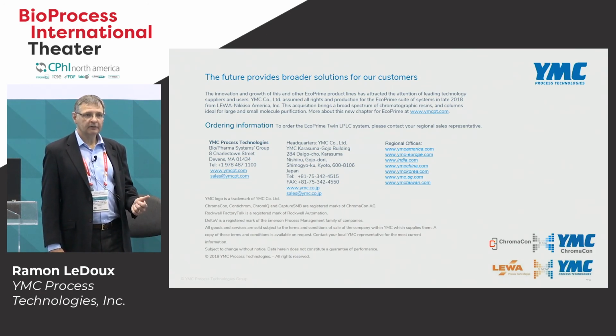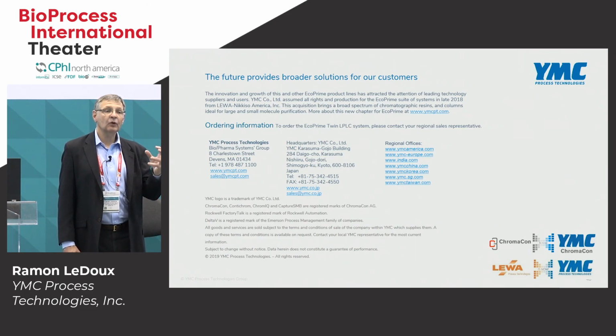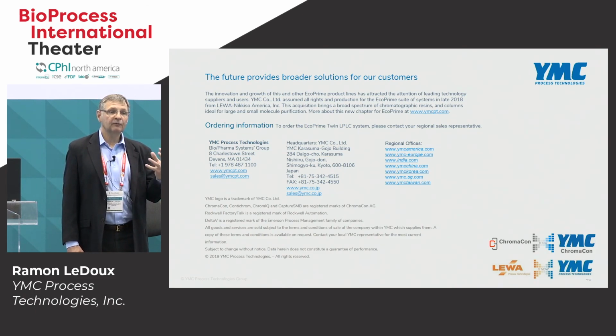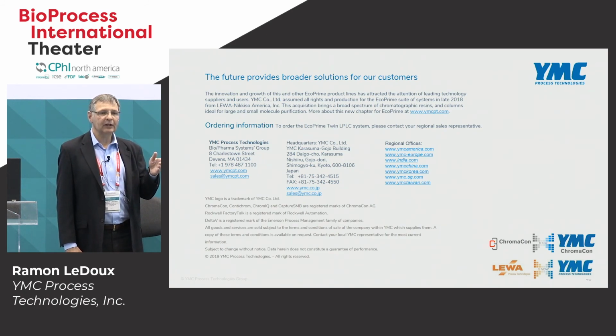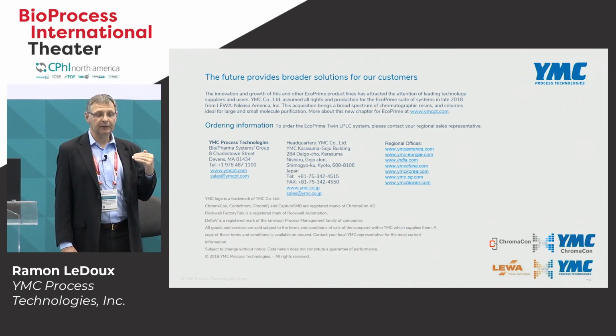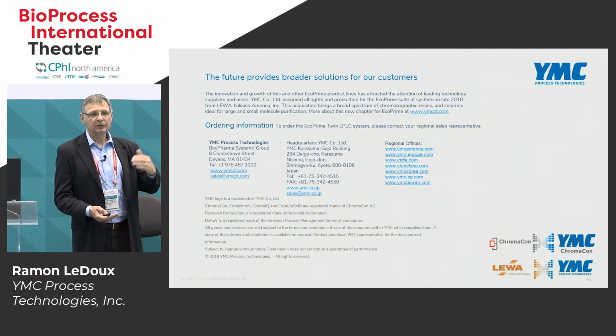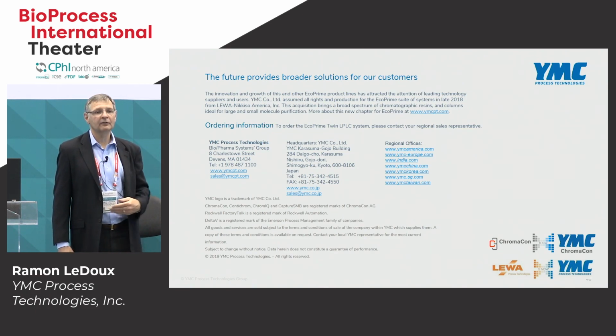Yeah, protein A is still the gold standard. I think what people are more interested in looking at now, not so much changing the chemistry because it's such a proven technology, but changing the orientation of the chemistry. So now you see immobilized, functionalized membranes as a strategy with very, very short residence times because they have no diffusional flow limitations. You also see, in terms of a packing stability strategy, to scale up using a reinforced bed, if you will, of membrane. So a matrix approach so that the resin is supported within the cartridge, which allows for higher stability under higher linear velocities. So enhanced cleaning flow rates, things of that nature. So it's still protein A, but it's just the way we use it and the way it's been developed.